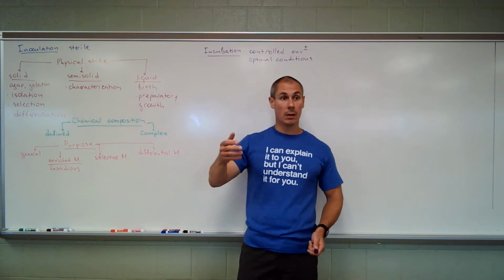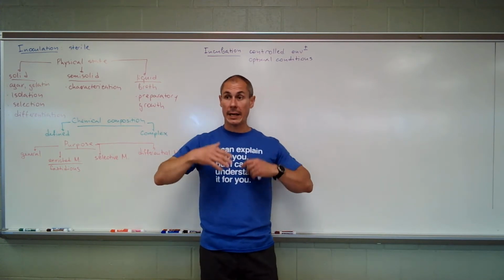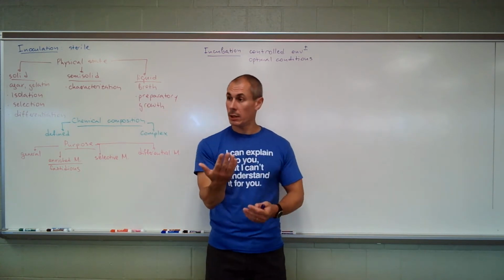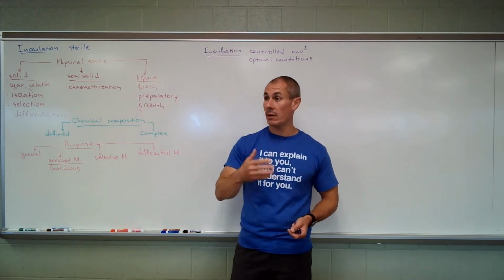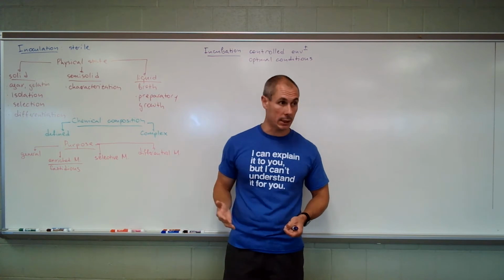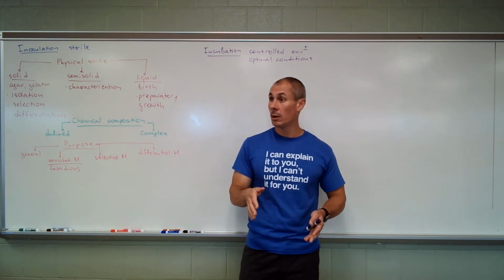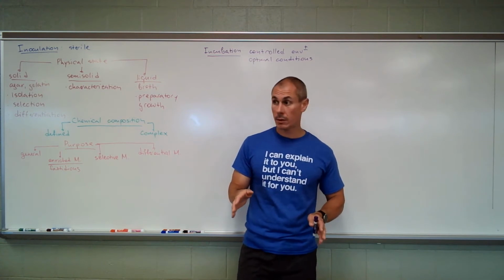And if I do my experiment and Jessica wants to do her experiment, she's looking at the manual, okay, he grew it at 37, I'm going to grow at 37, we can directly compare results. She doesn't have to guess what was the room temperature here, right? Make sense? That's an important part.